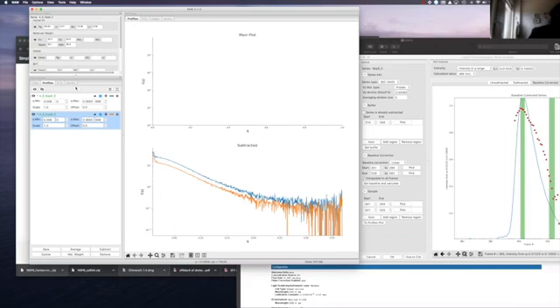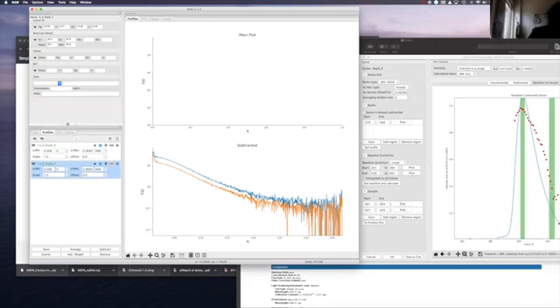And if you want to compare the values that you just did, you can just click on those files here, and you see the Rgs here and molecular weights down here, and same for the Rgs here, they drop a little bit, and molecular weights are dropping as well for this shoulder. You got some idea about how this behaves.